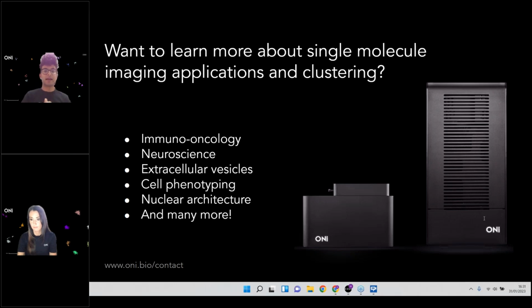And then maybe you're picking out nuclear pores, for example, and those clusters would correspond to a nuclear pore. And we hope to be able to relate all of these levels back to each other, so that you can say, okay, there were this many nuclear pore clusters inside these nuclei, and then across all the nuclei, I see this kind of distribution, or maybe these differences, depending on my conditions. So you definitely can do this.